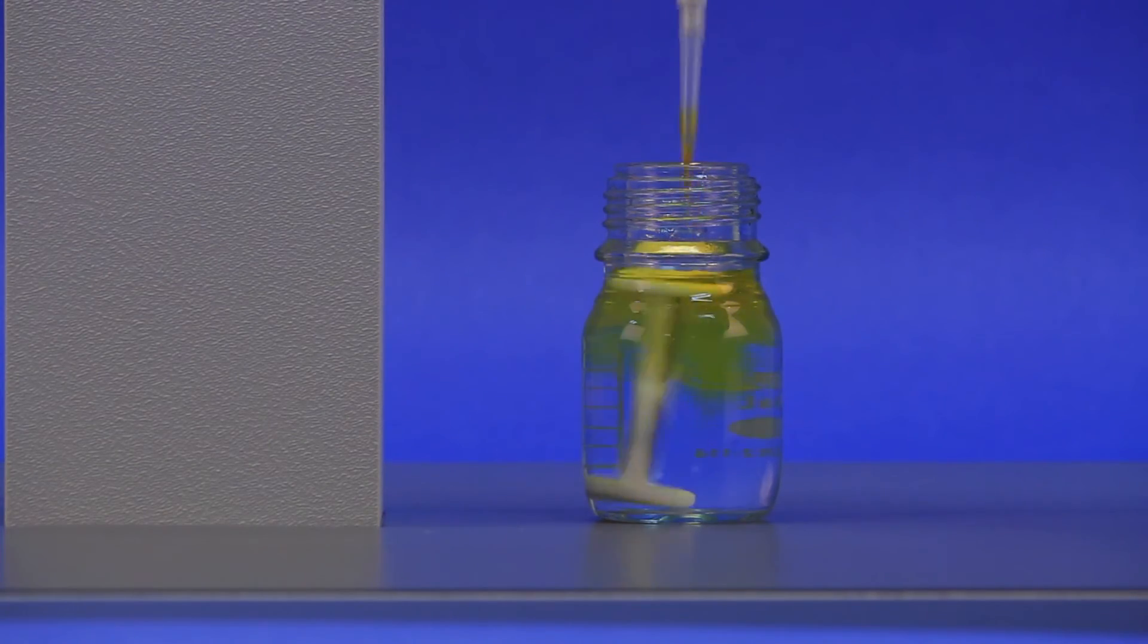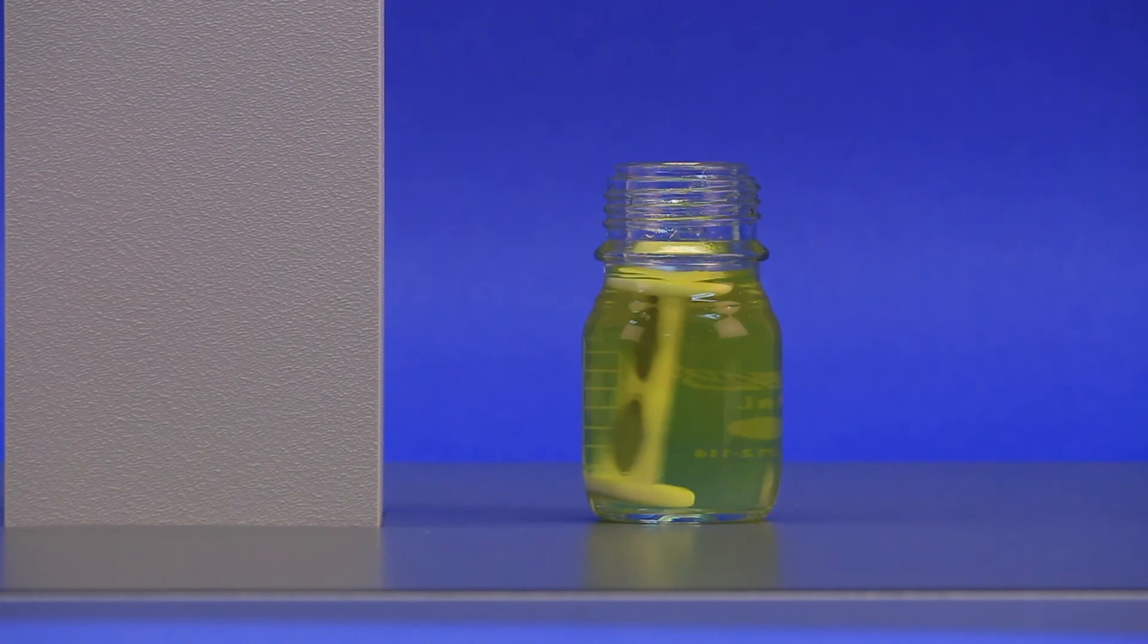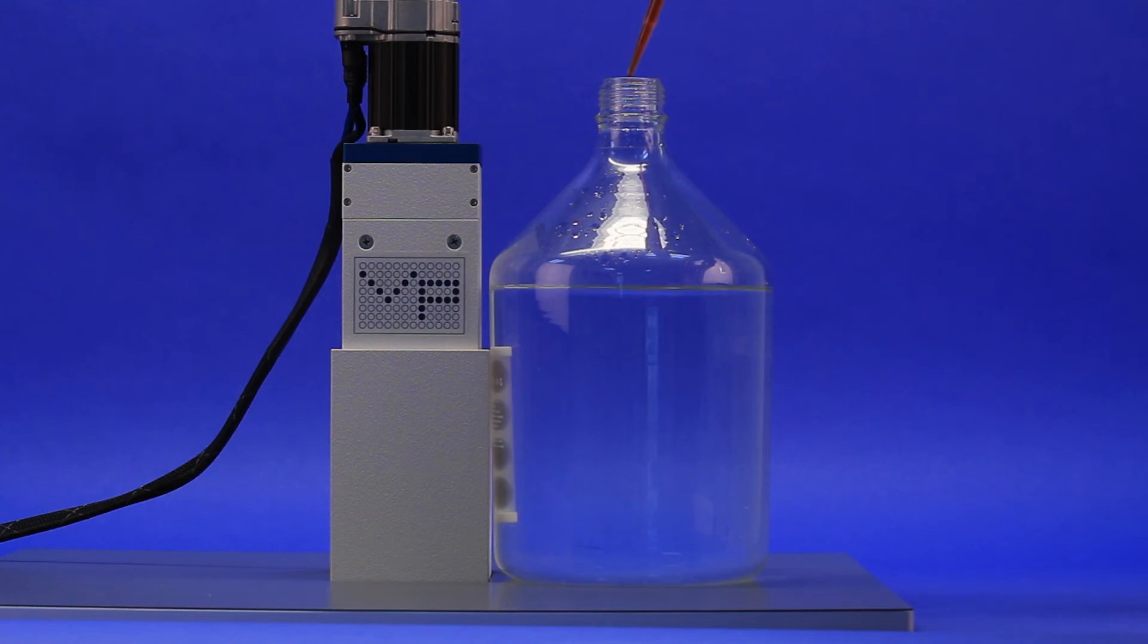The introduction of dye will demonstrate how quickly and evenly your sample is mixed. Any bottle size can be used.